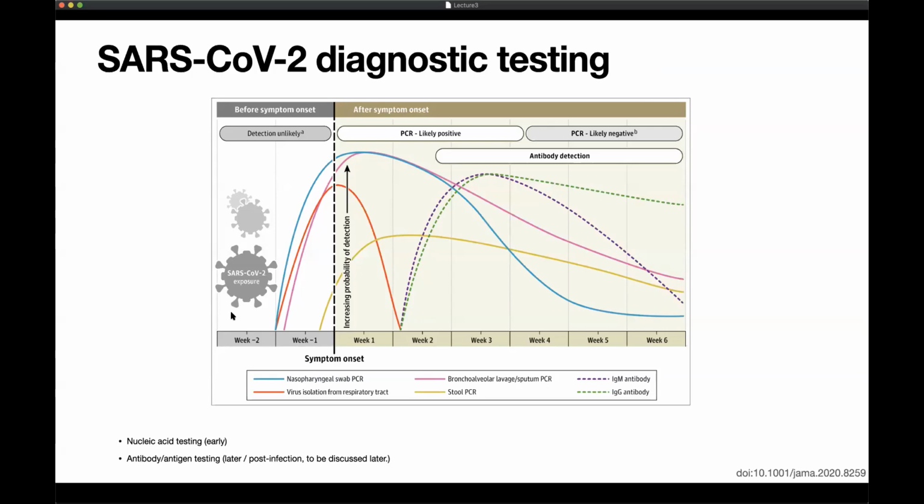All right, so again, none of this is unique to SARS-CoV-2. What is unique to SARS-CoV-2, I think, is the open source, open collaboration aspect of it, especially the contribution of folks in the Arctic network that were forward-looking and ready to go very early. So in large part due to their efforts, we had so many sequences generated and deposited so quickly. That's unprecedented as far as outbreak surveillance goes. And it was important to develop a validated and standardized set of primers and laboratory protocols for this to work.